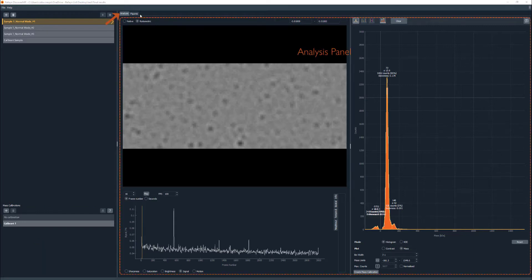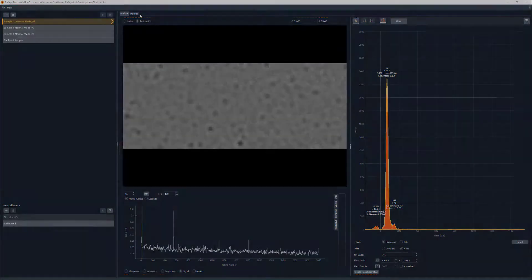On the right, the analysis panel is made available by selecting the analysis tab. This is where the analyzed data for individual measurements can be displayed.